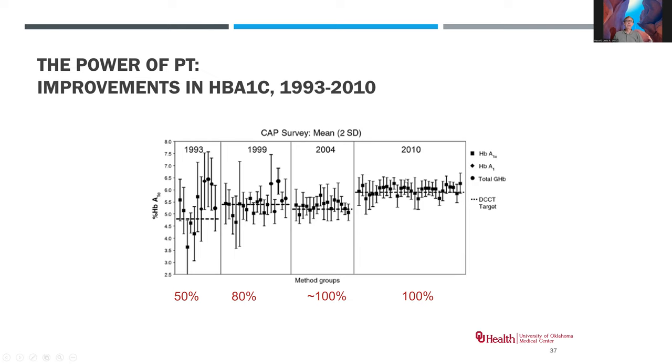Now, this is a combination effort, not just laboratories improving their performance, but also manufacturers, reagent suppliers, and so forth are engaged in this process to help you to be more successful. And so this is a very important step forward that proficiency testing allows you to accomplish, not just for your laboratory, but obviously affecting the entire industry. Now, this has been going on for decades, of course, and you would be the beneficiary of participating in this if you're not already.